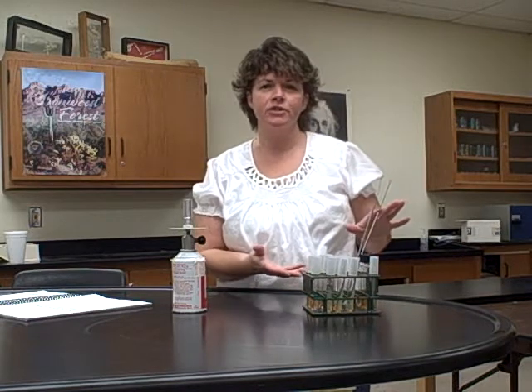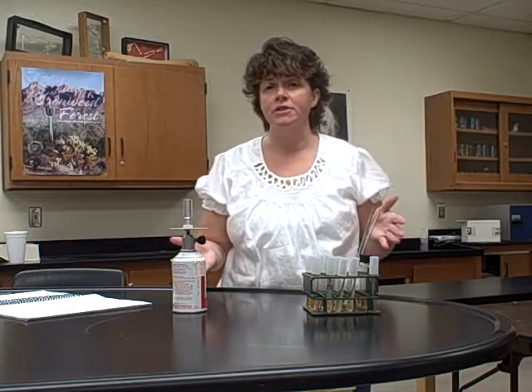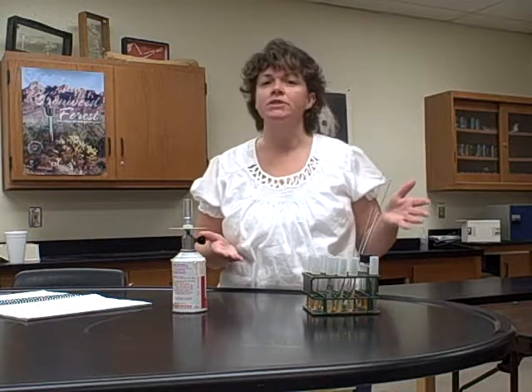So this week we're going to start doing a series basically from here on out. What's going to happen is we're going to inoculate tubes one week and then look at our results the next week. So the majority of the labs from here on out are going to be 2-day labs. They start one day and finish the next. Some of them will be done in one day when we look at the protozoa and things later, but from here on out, just be prepared to start one week and finish the next, okay?